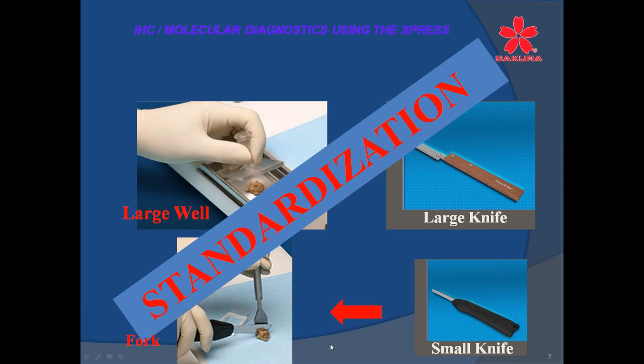I have put an example here showing if you use the cutting tool, the large well certainly will give you area to work with larger pieces of tissue and very thicker ones, and there's an appropriate knife to use. You know, in doing gross, which many of us have been involved with probably from early on, we did not always have the right tools, and now they are there. The special knives and blades and templates that can be utilized to cut the appropriate section thickness for our work.